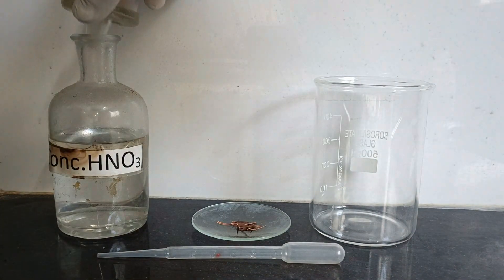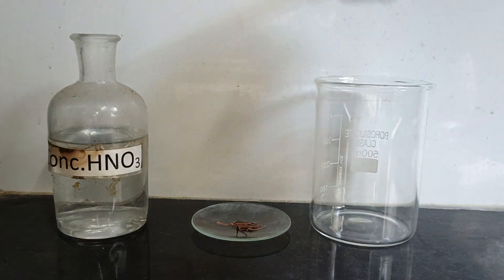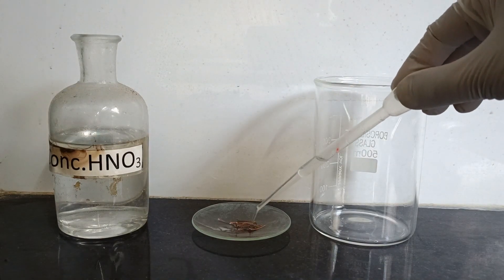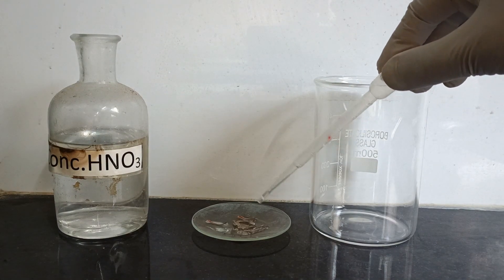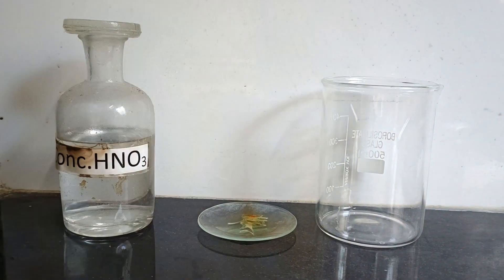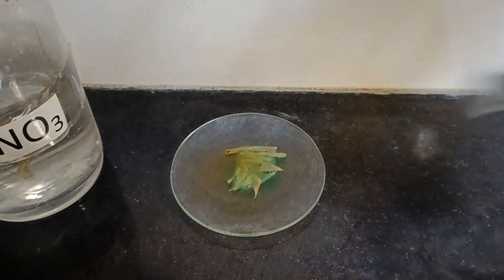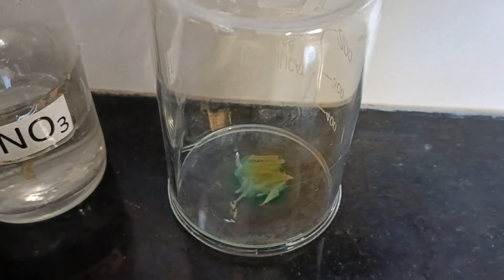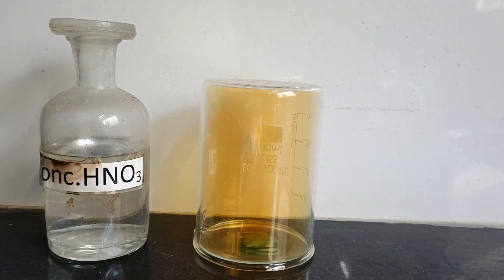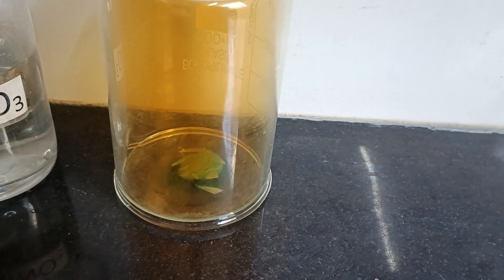Make sure you are wearing safety gloves for this experiment. With the help of a dropper, take about 1 ml of concentrated nitric acid and pour it over the copper pieces in the watch glass. The reaction immediately starts and the reddish brown gas of nitrogen dioxide starts to evolve. To capture the gas, I am inverting the beaker over the surface of the watch glass. As time passes, more and more nitrogen dioxide gas starts to accumulate inside the beaker.